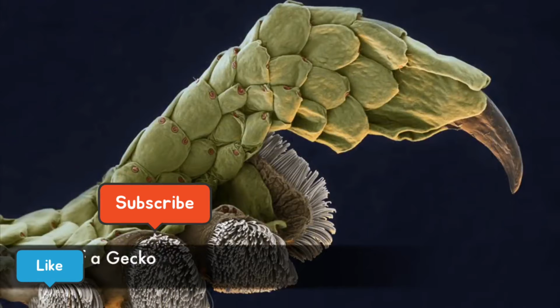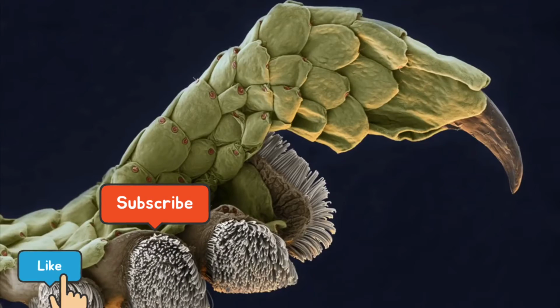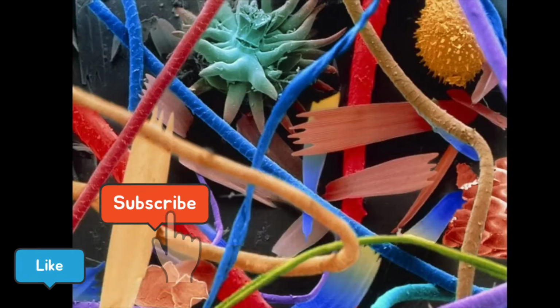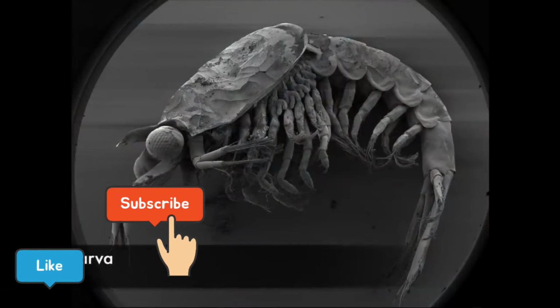The leg of a gecko. This microscopic photo is of household dust, containing long hairs such as cat fur, twisted synthetic and woolen fibers, a pollen grain, plants, serrated insect scales, and insect remains. A krill larva.